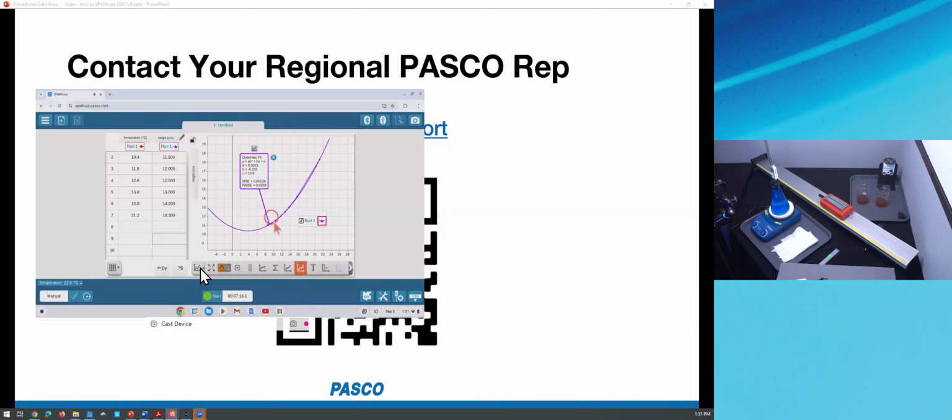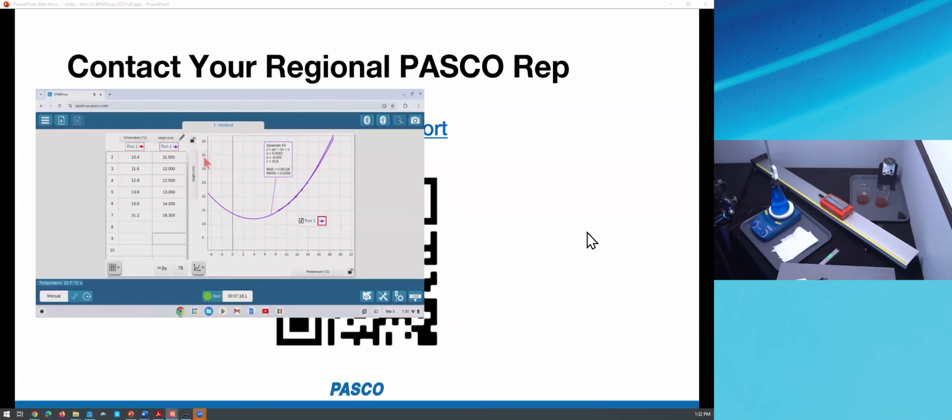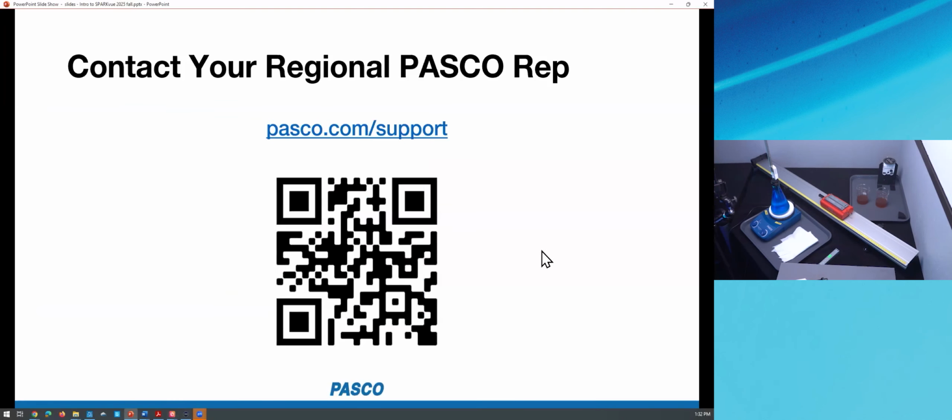And we can see it describes some sort of relationship between the height of the water, in this case representing a proxy for volume, and the temperature. And if you're a fan of water, you may be curious to see that it doesn't look linear. And indeed, you might ask yourself, well, what's the densest temperature for water? And it looks like our curve fit here reveals it to be around 4 degrees Celsius, which is indeed a unique property of water, that it's densest at 4 degrees Celsius. So, a quick investigation there, introducing the idea of manual sampling and designing your own labs through the build path.